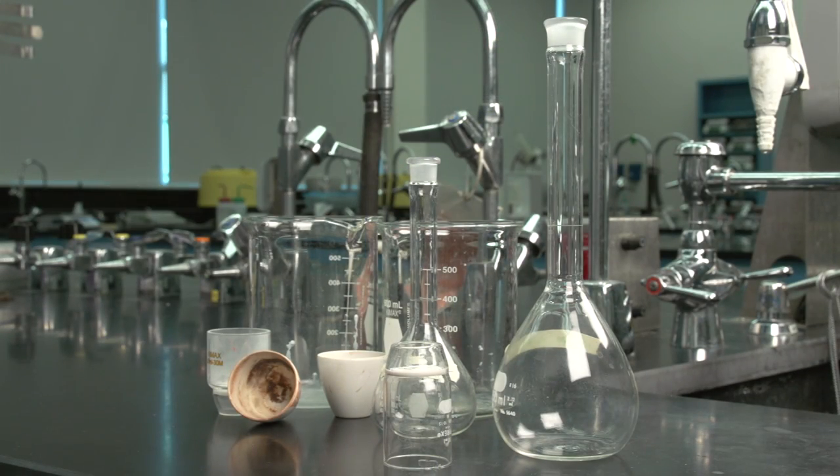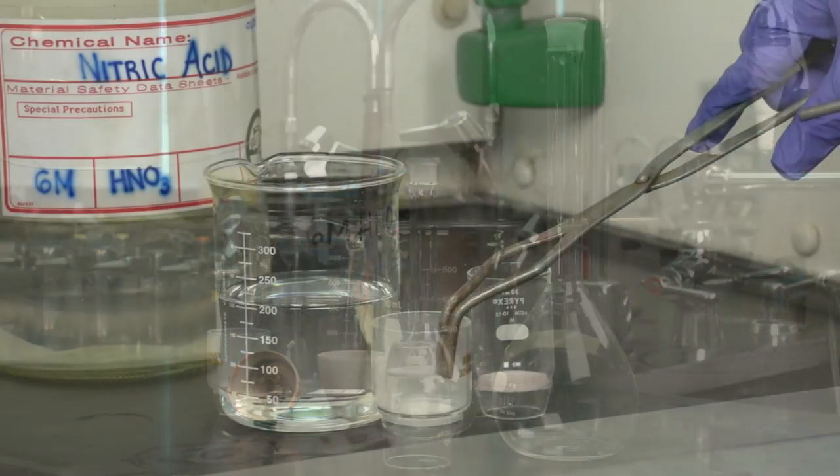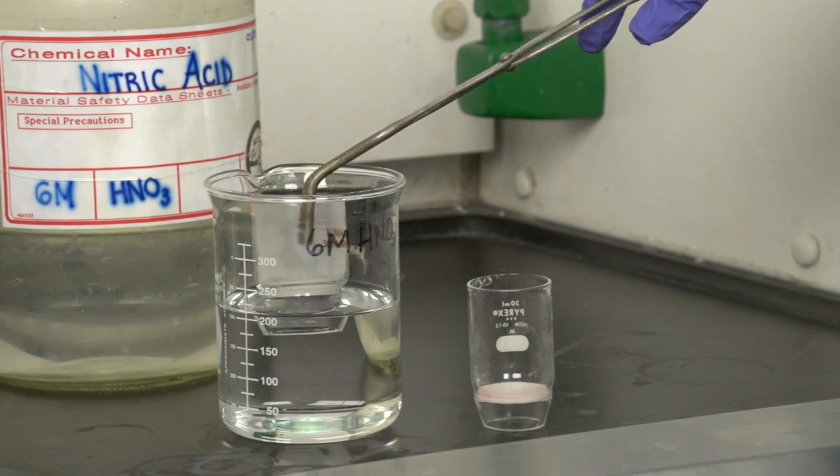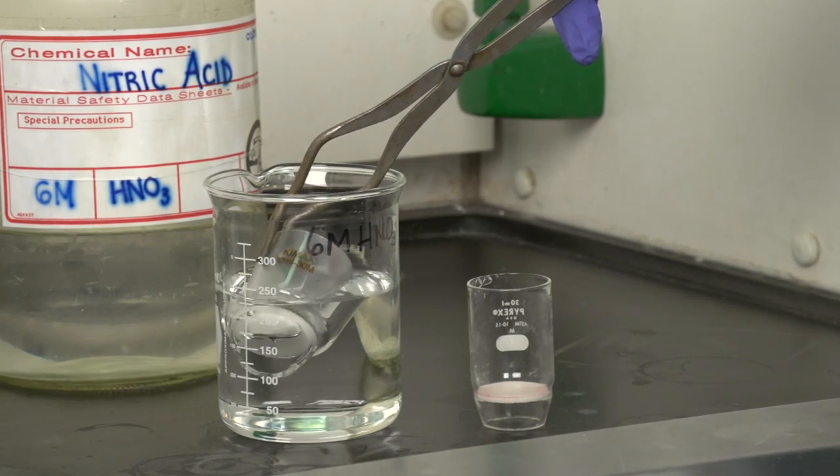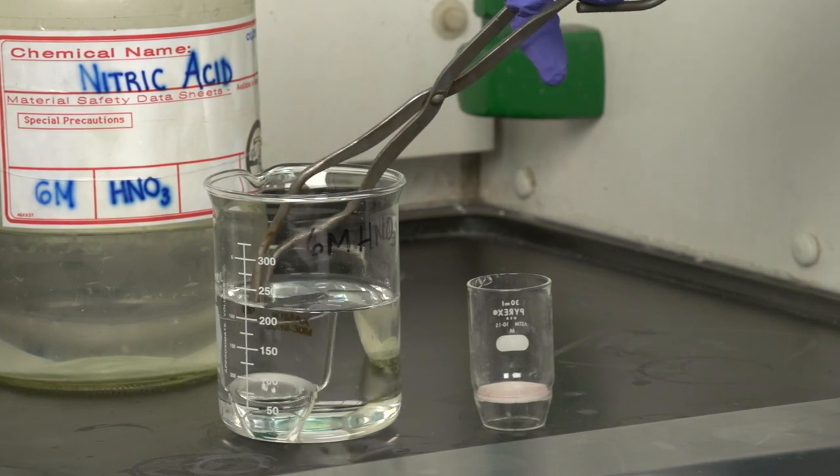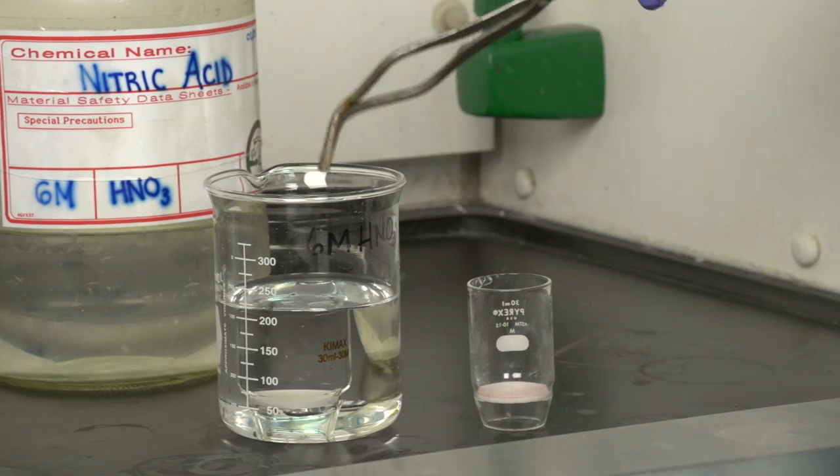Crucibles and other glassware that is contaminated with metals are cleaned by soaking in a solution of hydrochloric or nitric acid. Concentration is dependent on the type of residue to be removed.